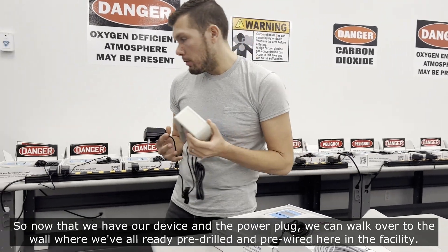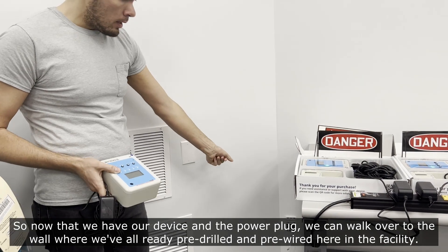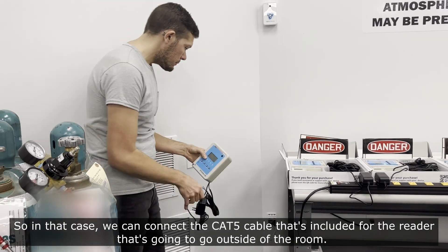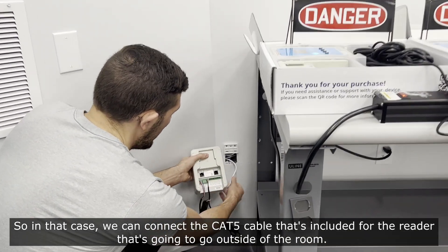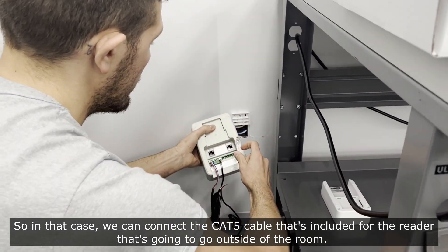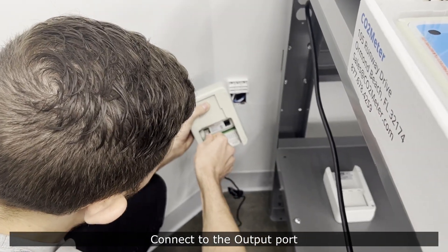Now that we have our device and the power plug, we can walk over to the wall where we've already pre-drilled and pre-wired here in the facility. We connect the cat5 cable that's included for the outdoor reader — that's going to go outside of the room — and connect it to that port.